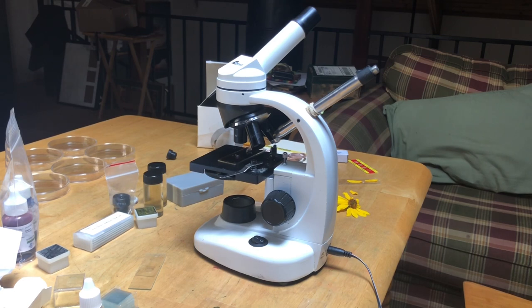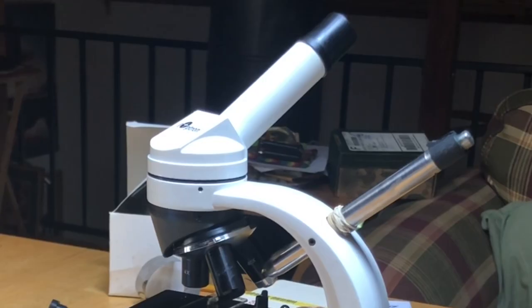And I'm going to talk a little bit about the anatomy, for lack of a better word, of the microscope and then how to go about using it. So on a compound microscope, which is the type of microscope that this is, you have your eyepiece which is an optical lens.